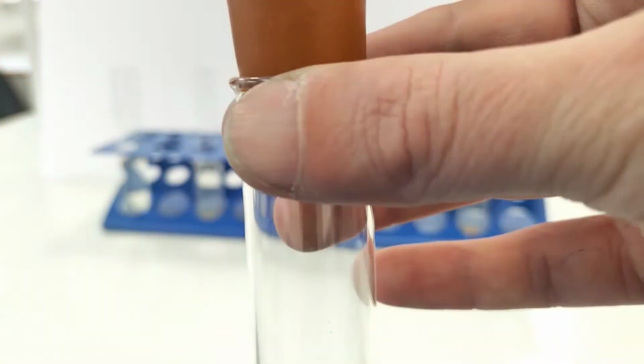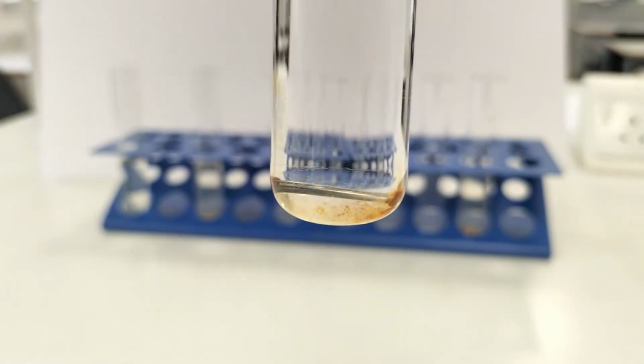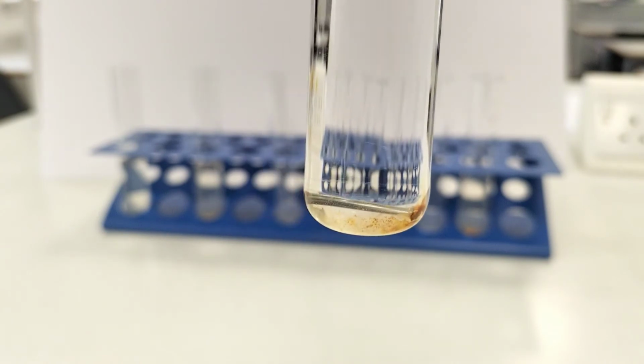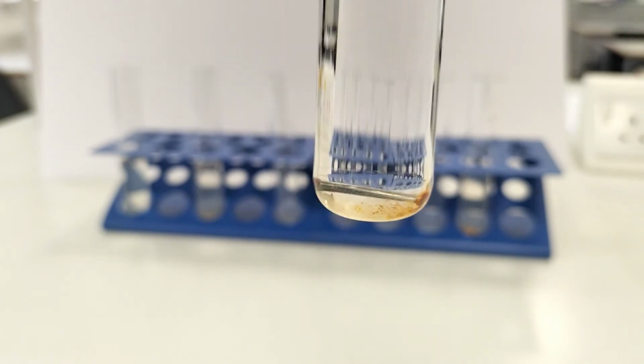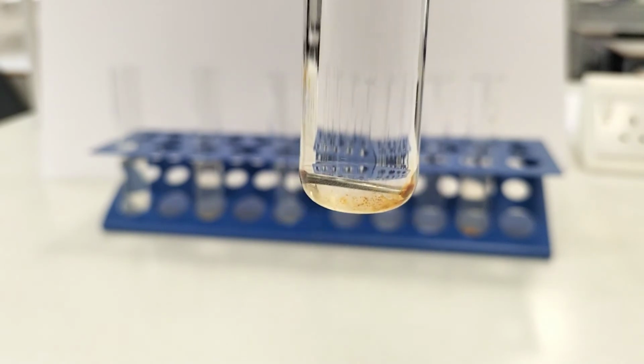We then sealed with a bung to stop any more fresh air really getting towards that nail, and you can see that it has had a marked effect on the rate of rusting. So higher temperatures decreasing the concentration of dissolved gases in the water, including oxygen, seems to have had a decent effect in reducing the rate of rusting.